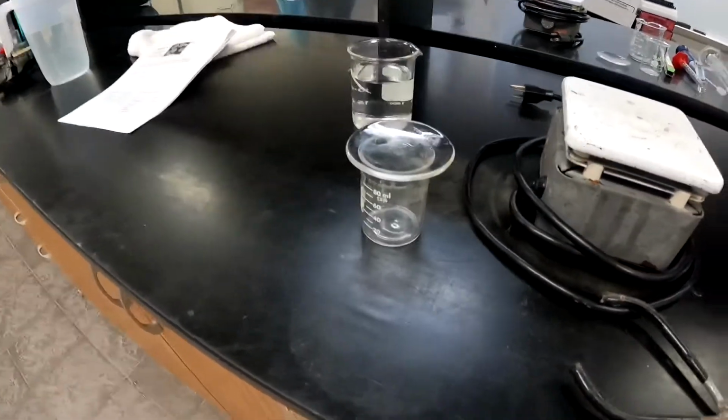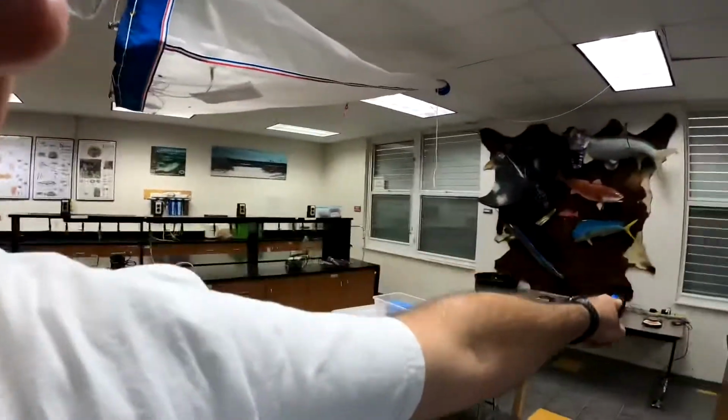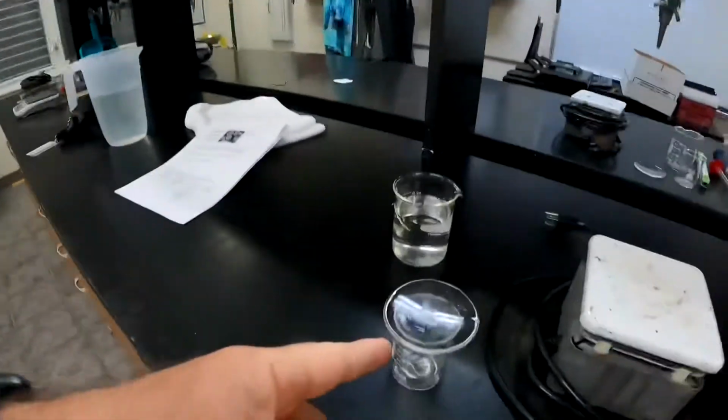Let it cool for a few minutes, and then once it's cooled, take it back over to the scale and determine the mass again. With a little bit of math, you can calculate the mass of just the salt. Oh yeah, once the hot plate is cooled down, unplug it and wrap the cord back around the hot plate.